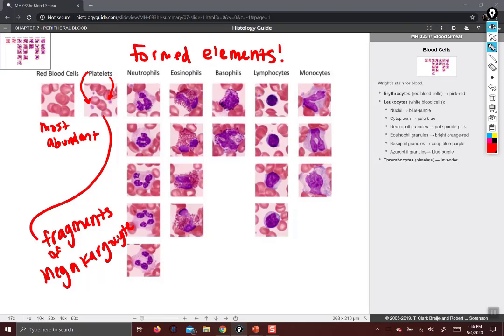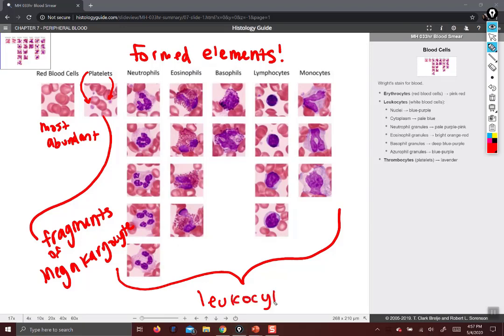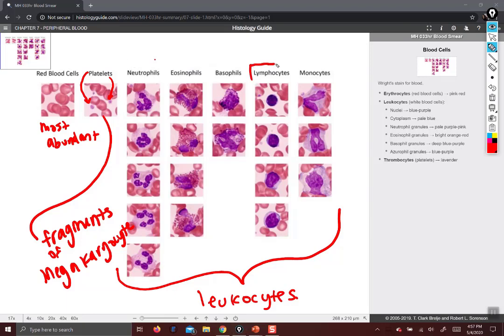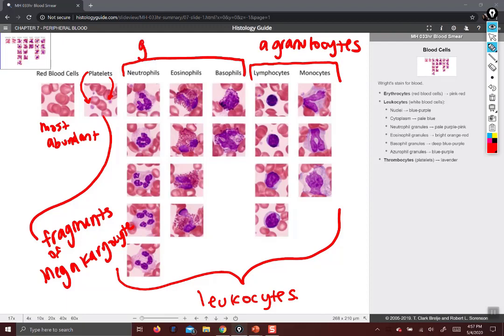Neutrophils are the most common kind of white blood cell, or leukocyte. Leukocytes is the group of cells that includes all of these. Within the leukocytes, these are the agranulocytes, and these are the granulocytes. Granulocytes just refers to the fact that they have cytoplasmic granules in them that are often quite visible.